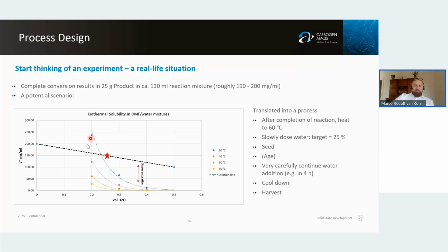So this is another data set. The data set I showed before, with a lot of extrapolation, was from the preceding step of that one, but I would now talk a little bit about this one because here we have more data to discuss. I did the same thing as before, with a little less extrapolation of data, but still we have the isotherms here in DMF-water mixtures.